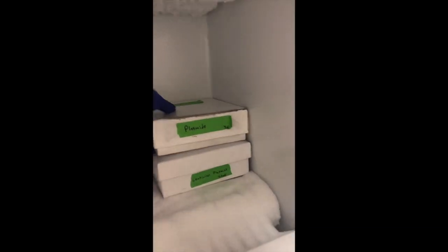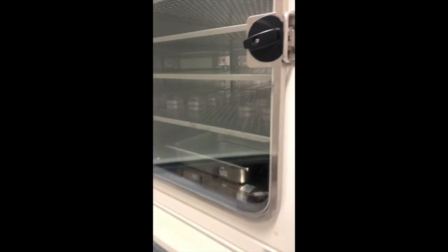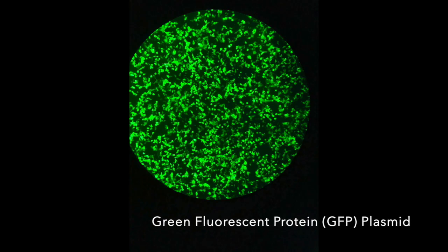First, we put circular pieces of DNA called plasmids, which contained our genes of interest, into our human cells. After a day of growth, we started the Co-IP.